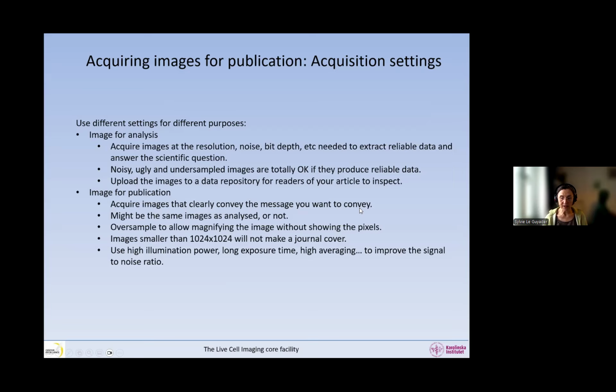So you have to decide yourself, what is it that I want the viewer to see? And the viewer should see the message straight away. So it should be quite obvious. Okay. So this is the way you're going to acquire these images: to convey a message. So it is not systematically at all the same thing as the images that you acquire for analysis.